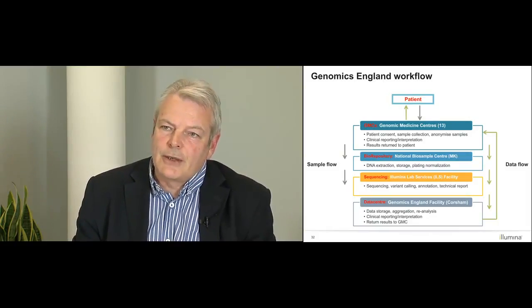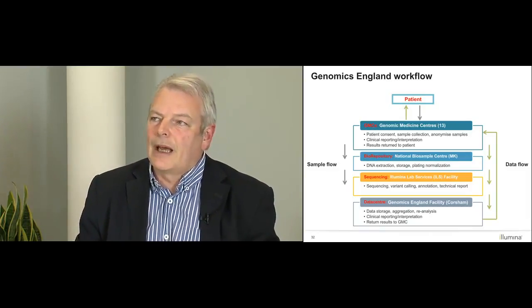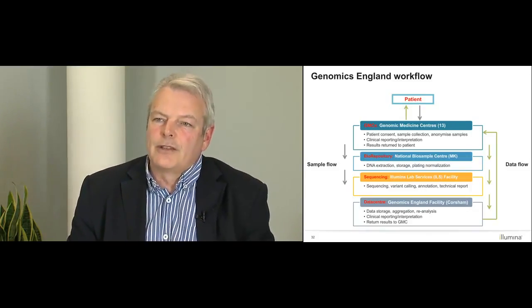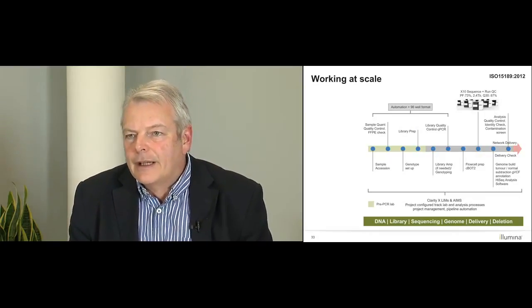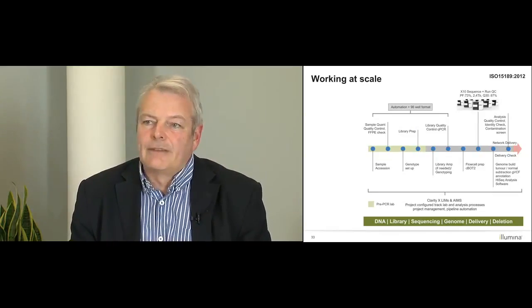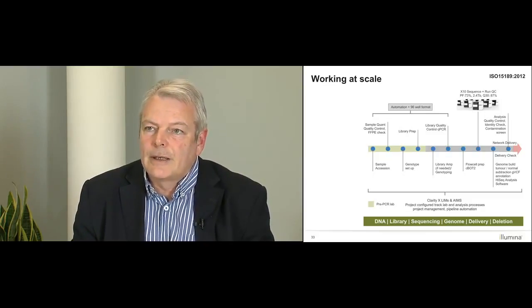Just to zoom in on the sequencing process for a moment, because this has been an area of significant concern. How do we handle all the data? How do you convert from a research one-off process to a highly scaled, fully monitored process? This illustrates very briefly the workflow from left to right, from DNA to library formation to sequencing to delivery, and then eventually deletion of the data when it's no longer required at the generation site.